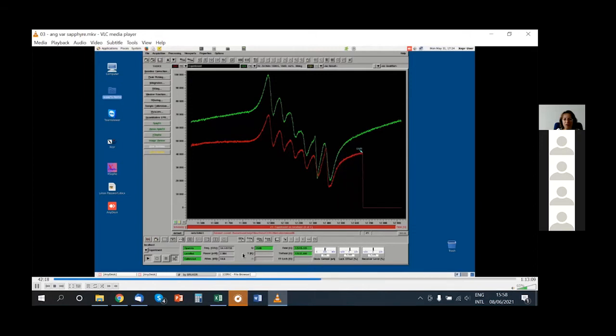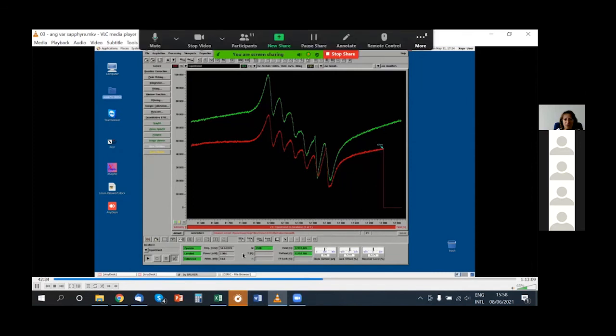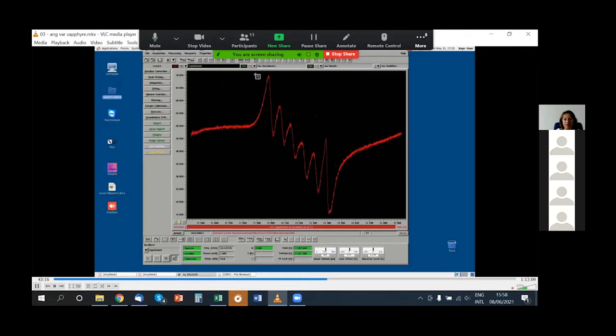While rotating, we change the Q factor, and also we change the signal to noise ratio, you will see. Still it's quite the same.